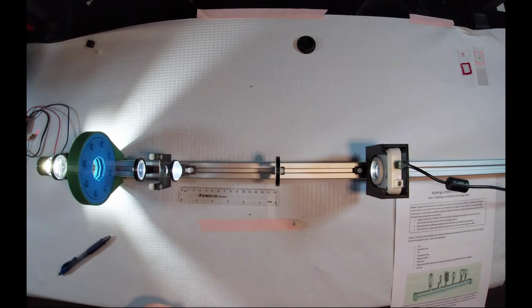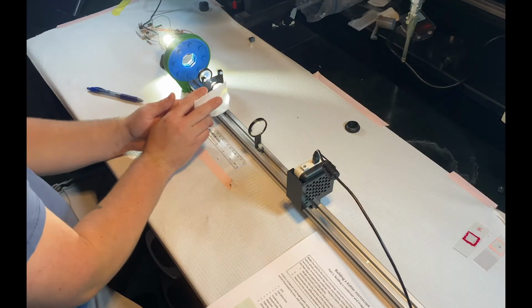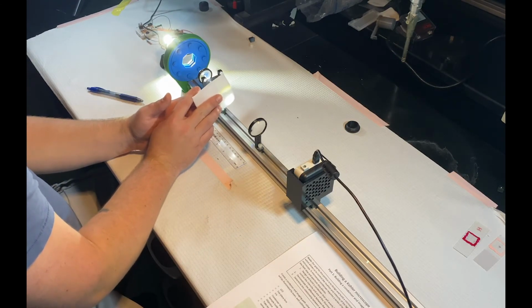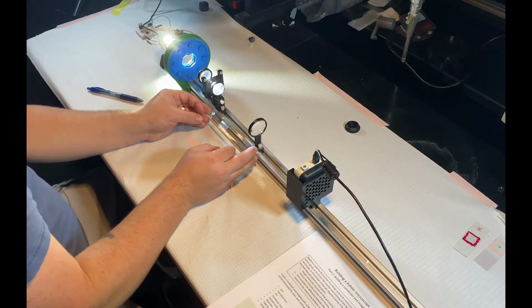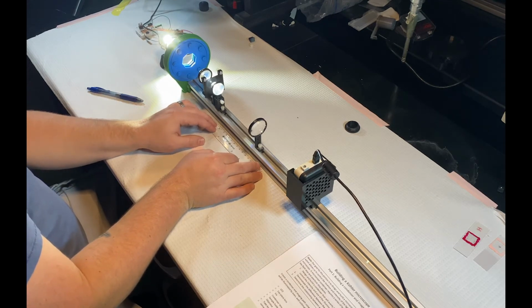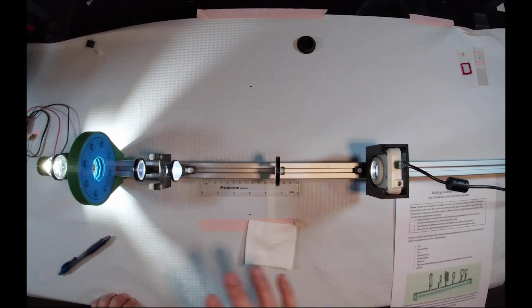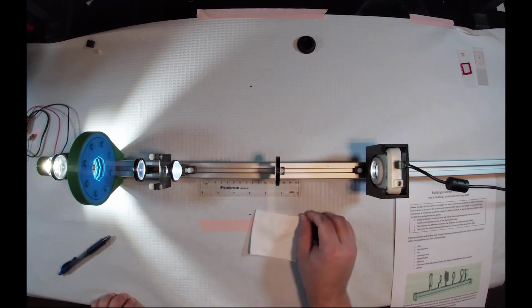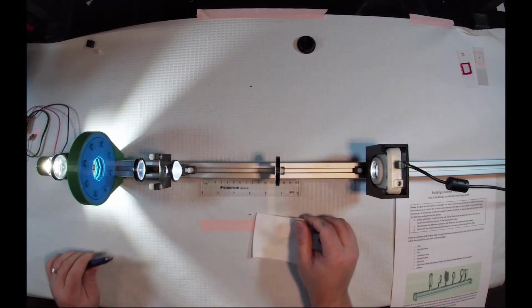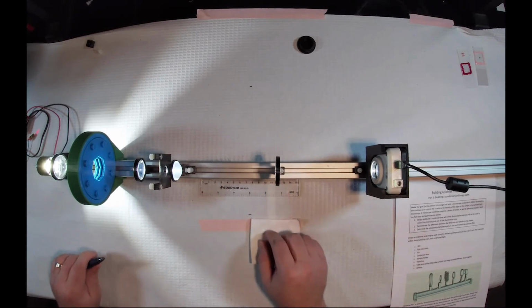Now we know that the objective lens is going to have a back focal point or back focal plane, which is going to be roughly 20 millimeters away from that. And you can probably visualize that focusing. I'm going to just do a quick measurement so that I mark pretty much where I expect that back focal plane to be. And then we have our tube lens. You should already sort of know what magnification this will produce. Actually, now that I think about it, I believe that we calibrated the magnification for no, we did it. We did it with this tube lens.